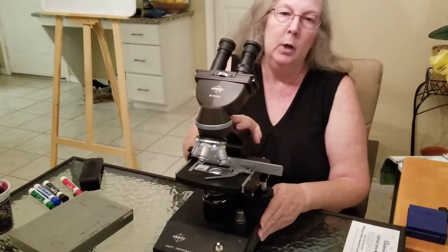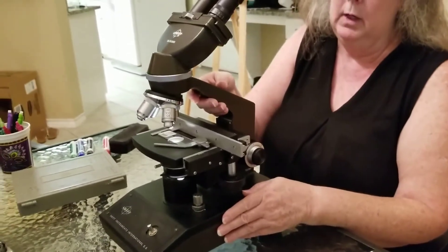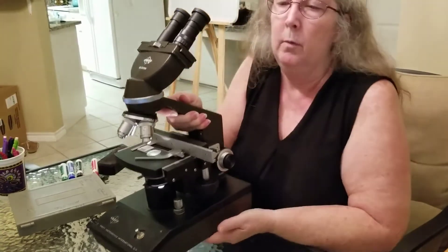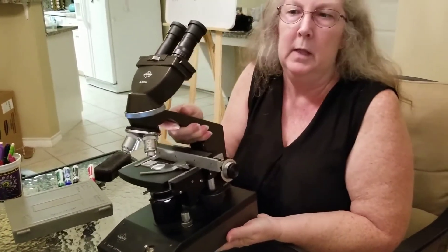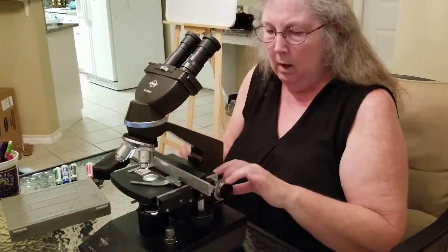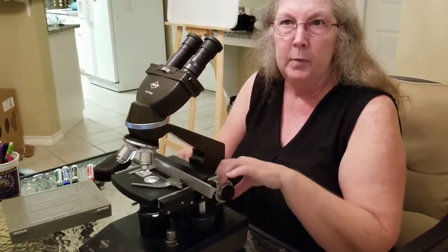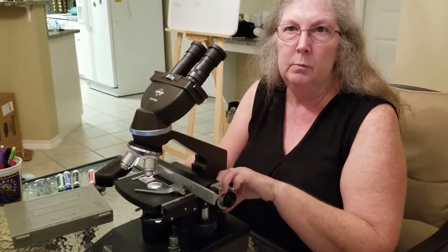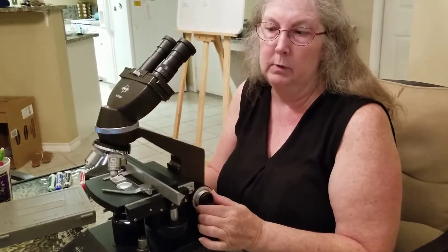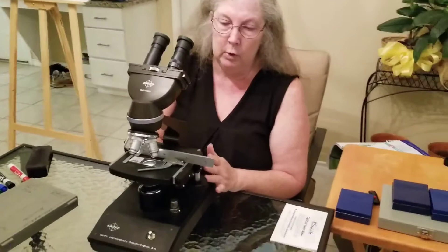This is the base and this is the arm. Whenever you move a microscope, you need to always use two hands — one hand on the arm and the other one under the base — because they are heavy and expensive; you do not want to drop it. To focus, you have the adjustment knobs back here. The larger one is your coarse adjustment and the inner smaller one is your fine adjustment.